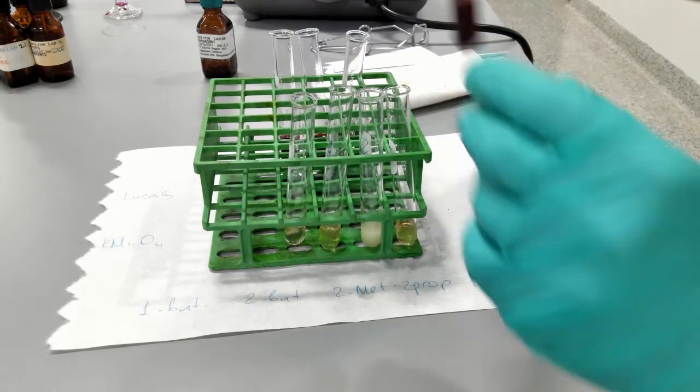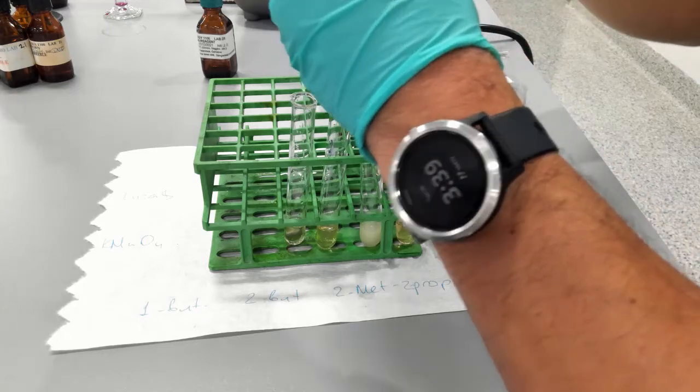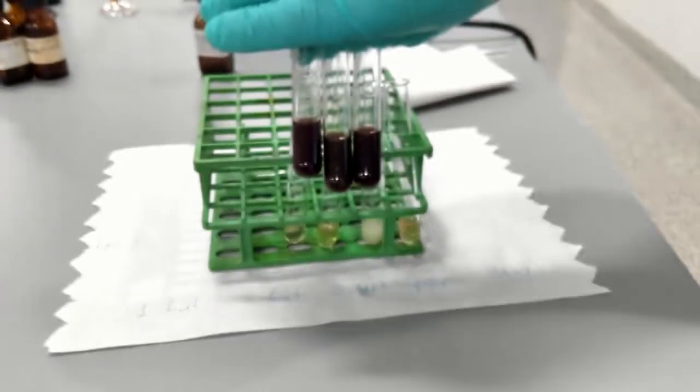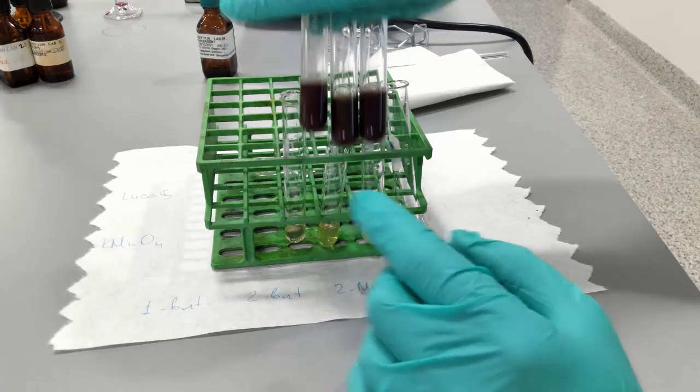So it's either primary or secondary. So let's compare them all 3. It's a little bit hard. It looks like primary, but we need to confirm it even further. You see that color-wise it looks more like a primary. Primary, unknown, secondary.